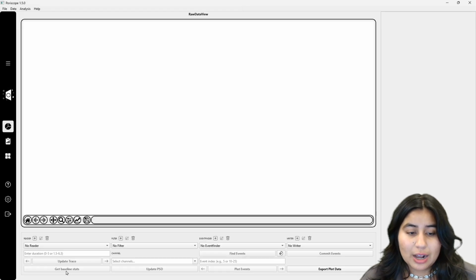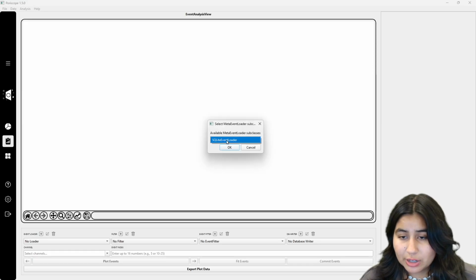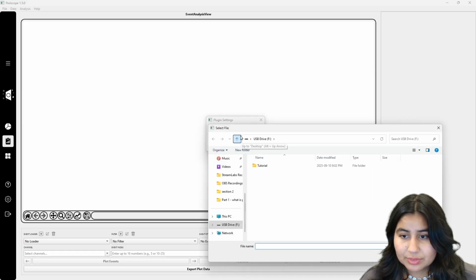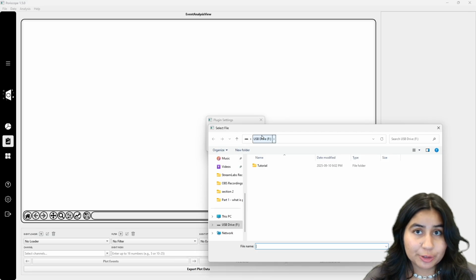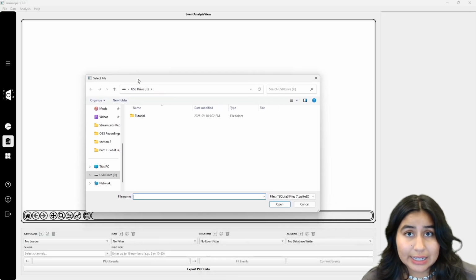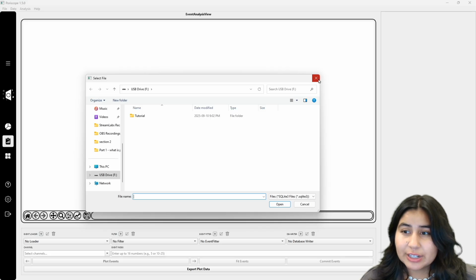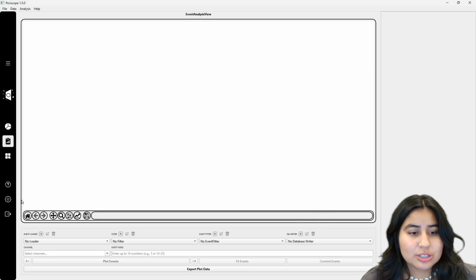So whenever I want to add a file, let's say here, an event loader, it's going to open the USB, because that's where I said I want Poriscope to look for data. But this only works as long as it doesn't get trumped by a most recent history item in which the location was different. That can also happen for practical reasons.